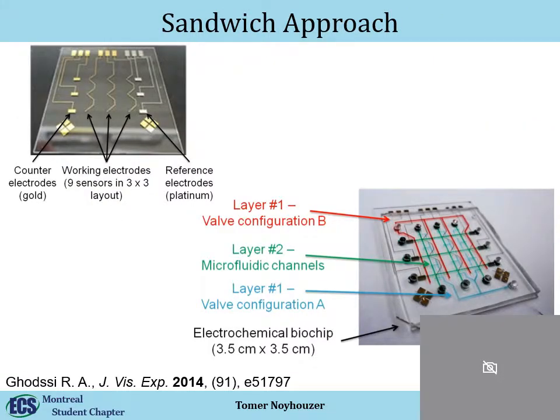Now, here's another type of one of those systems. So here we have 9 sensors. So we have 3 lines. Each line has 3 electrodes, 1, 2, 3. And you can see here are our electrodes. Now, we don't want to expose all this wire, right? We just want to expose the tips, the electrode. So the first layer, this layer, will be the layer that you see here. You have all the printed electrodes, and I told you, it gives you more flexibility because it's easier to design the spread of your electrodes in your system and everything.